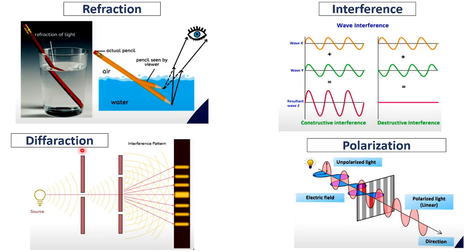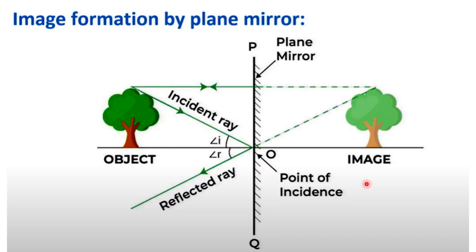And we also discussed what diffraction is during XRD. It is a reflection followed by interference, and it will create this dark and bright image. And of course, through polarization we can polarize the electromagnetic radiation. Since light is also electromagnetic radiation, we can polarize it, and by a polarizer we can determine different properties of any material through the polarization of the light.